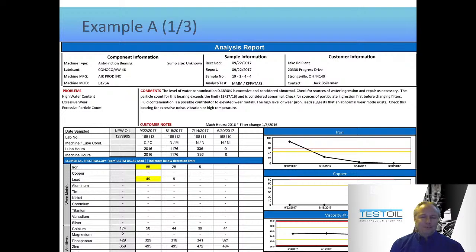And I go, no. This particular bearing was being sampled, as best as we can tell from the last 3 samples, every month, once a month, every 4 weeks, however you want to think of that. So you wait an absolutely normal interval, right? If you shorten the interval, it changes how that trend appears. So no, we wait a whole month and leave it in.